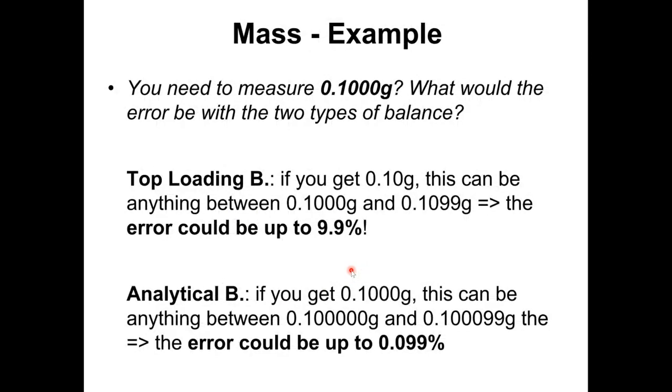Now, why? What is the basis of this choice? As I said before, please take what I'm saying with the benefit of the doubt, but the acceptable error is 1%. And to see how you get there, we go through these two examples.